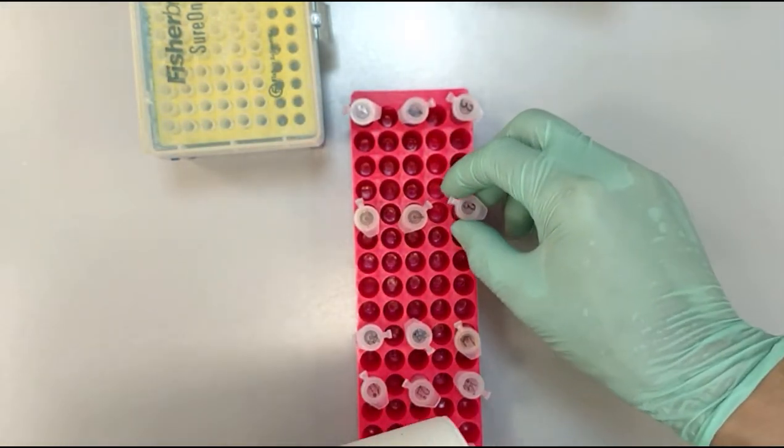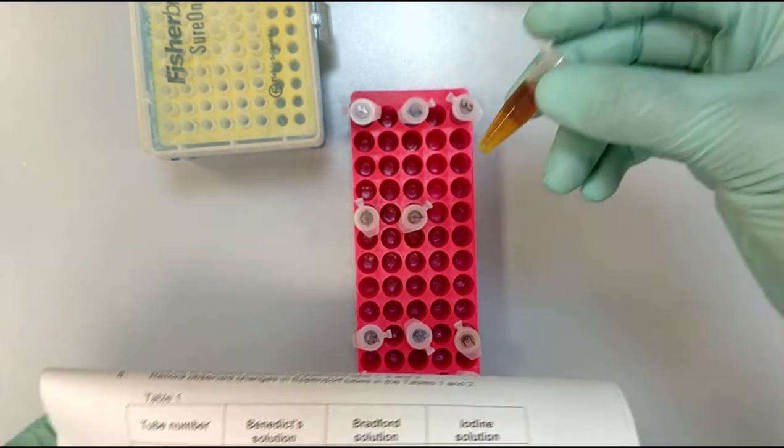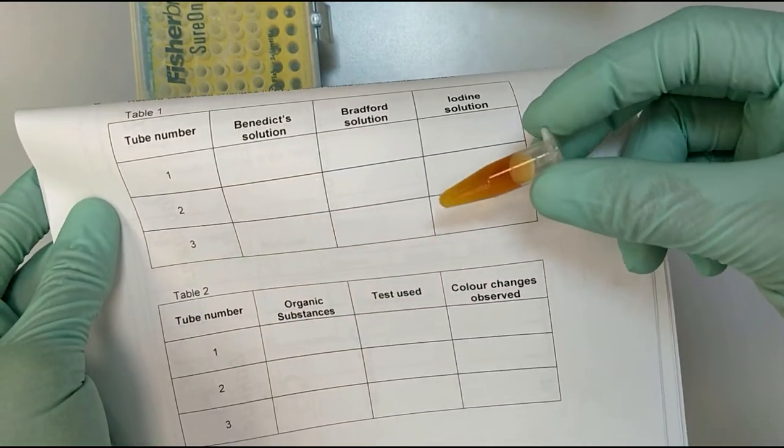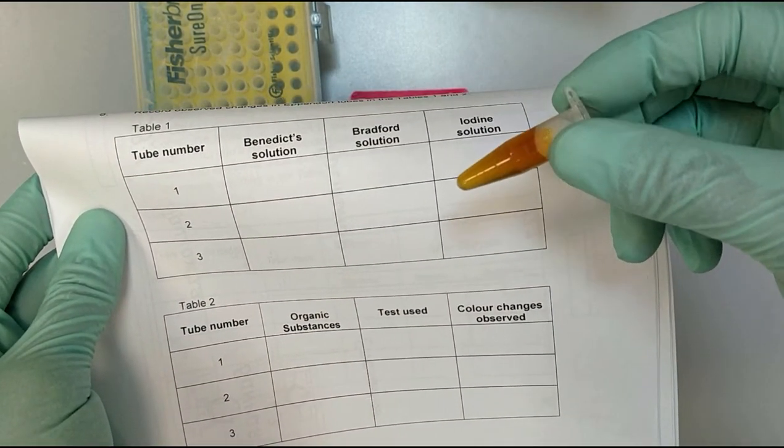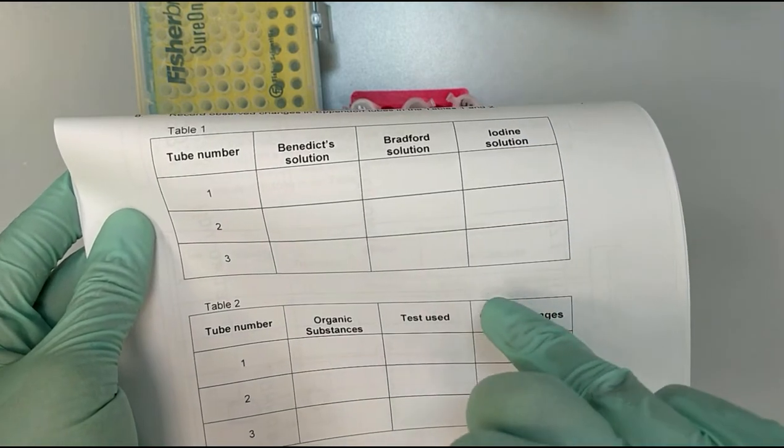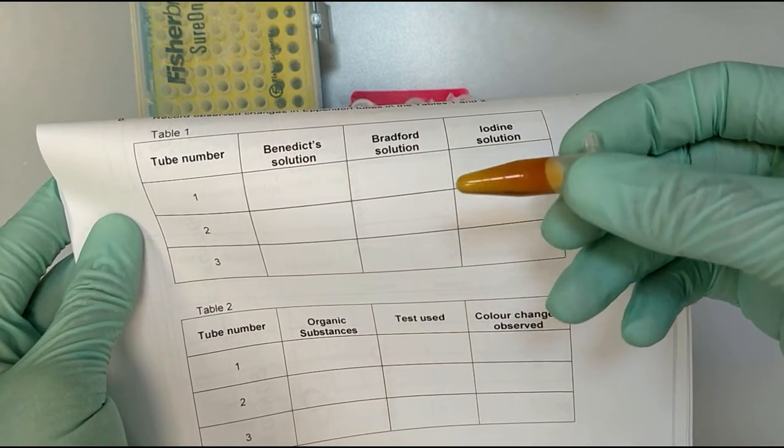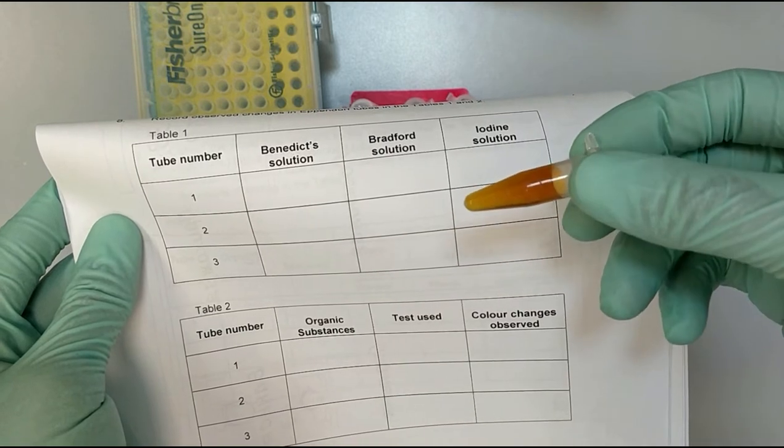So for example here we have the addition of iodine to the third tube, and you are going to write down light brownish, for example, or whichever you can see here.